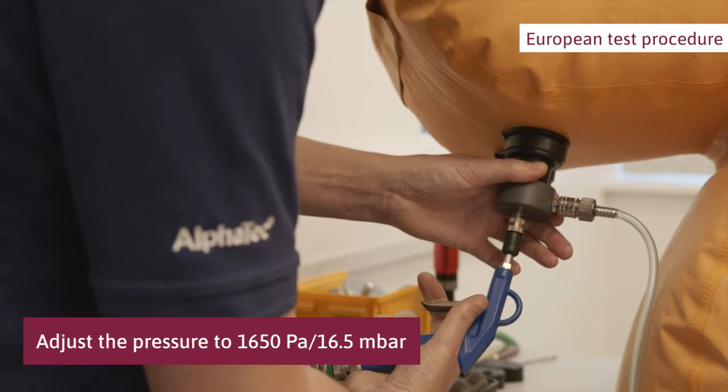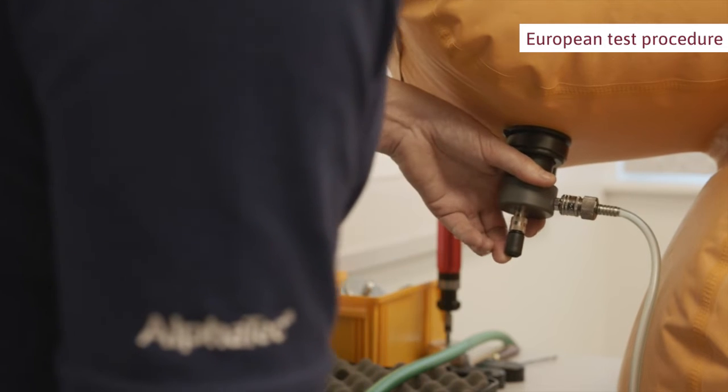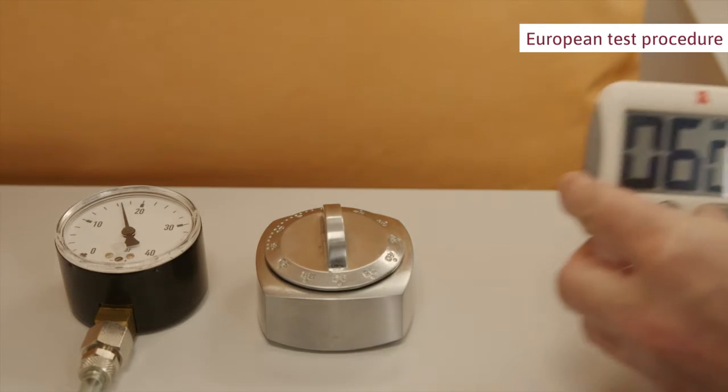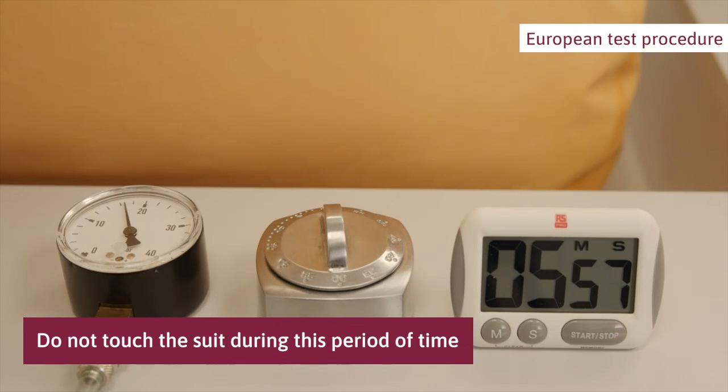After 10 minutes, adjust the pressure to 16.5 millibar. This is the test pressure. Set and start the timer and wait for 6 minutes. Do not touch the suit during this time.